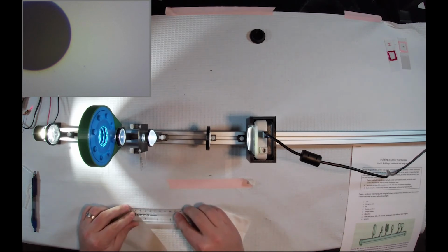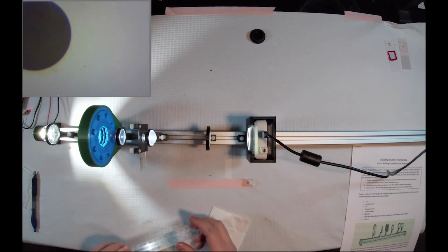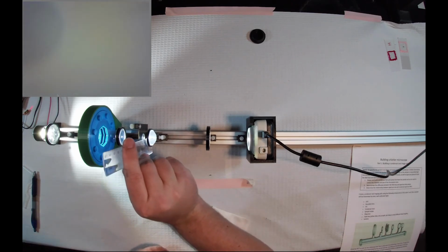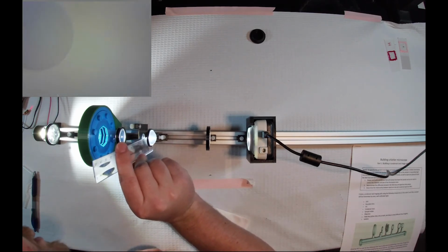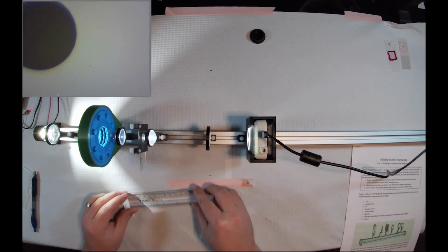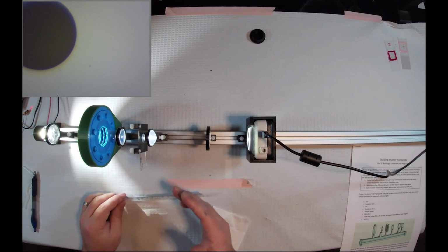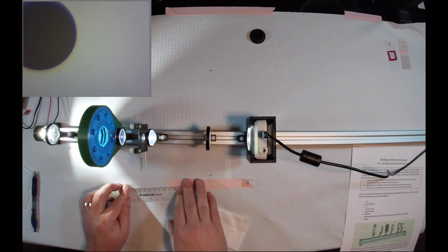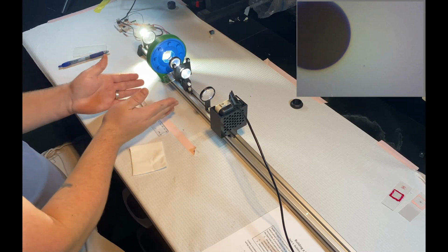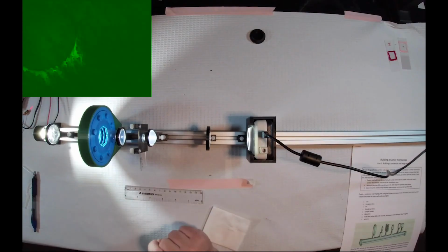You can also run through calculations on what is the numerical aperture of our objective lens. And if you do just a quick measurement, you can see that our objective lens to my eye is around 25 to 28 millimeters in diameter, but its focal length is much shorter than that of the condenser, as you can see in the setup, because the objective lens is mounted much closer to our sample than our condenser is.